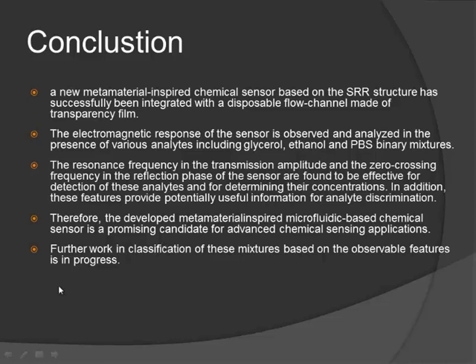And for future work, classification of these mixtures is in progress.